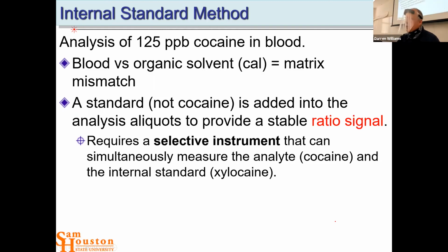If you put a mixture on the infrared, you're going to have all those peaks on top of each other. Now it's somewhat selective because the peaks are narrow, and you could find a peak associated with substance 1 and a peak associated with substance 2, but not always. And so if you could separate those substances, then you would definitely have more selectivity.